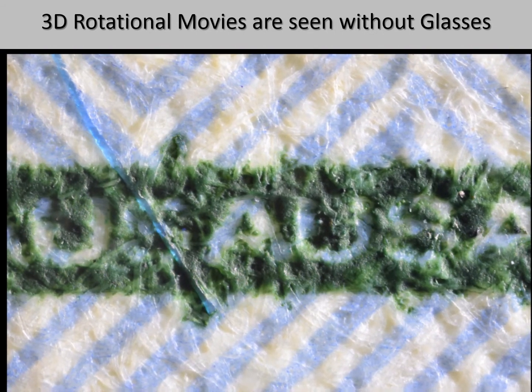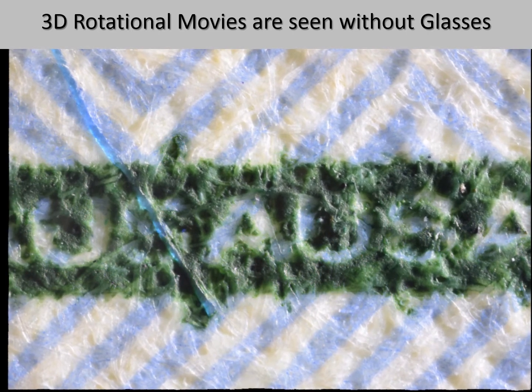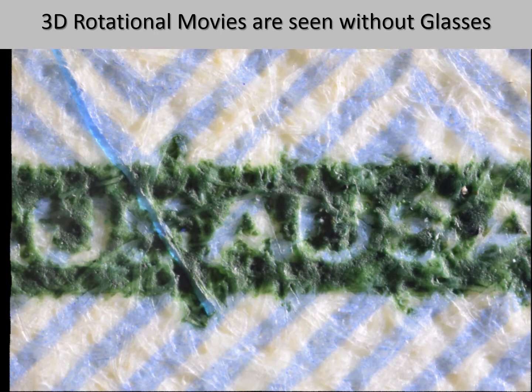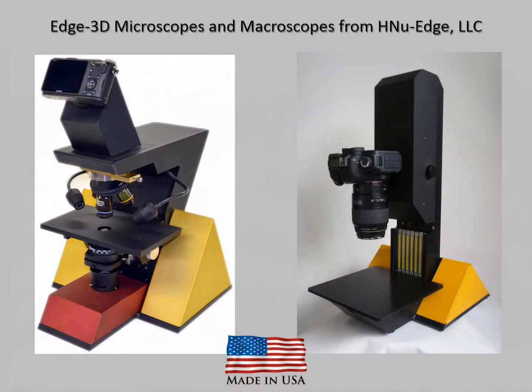The 3D image of the microprinting shows the three-dimensional nature of the quality of the printing. The Edge 3D research microscope shown on the left produced the images shown in this presentation.